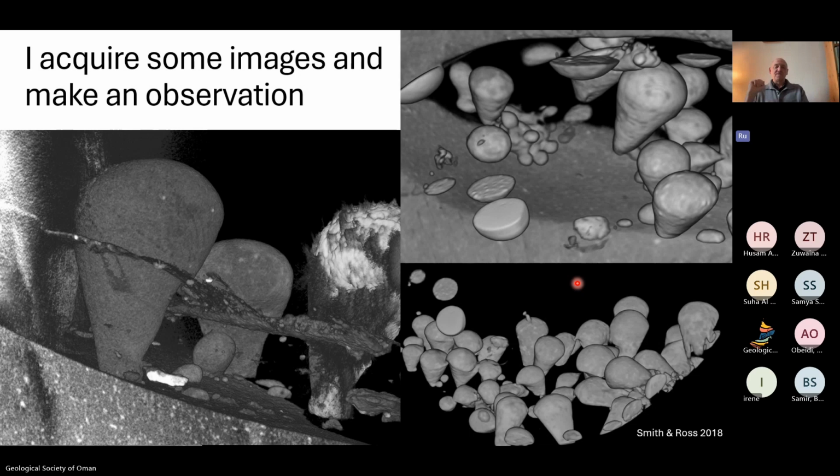But in this case, it fell to me, and I teamed up with Andrew Ross to bring in some specimens from Edinburgh. So on the right are some images, beautiful 3D images, and it's got, again, a lovely density contrast, like the pyritized trilobite. So you can actually see the shape of those structures in 3D, shaped like little clubs. Yeah. So next slide.